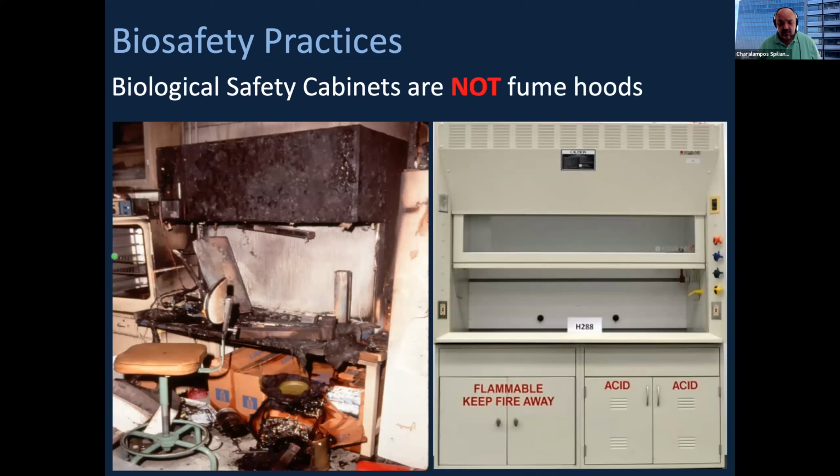Petros actually did talk a lot about these. Fume hoods that we have in our labs are to store flammable material and also acids or bases. Okay, these are different from the biosafety cabinets that we have in the tissue culture rooms. So you have to be careful what to store in each hood, in each cabinet. Okay, flammable materials have nothing to do and should never be stored in biosafety cabinets.